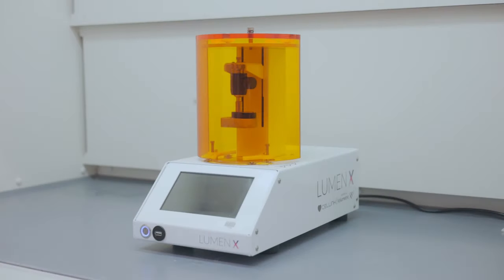The Lumen X is a digital light projection or DLP-based bioprinter. It uses visible light of 405 nanometers to cure liquid resin.